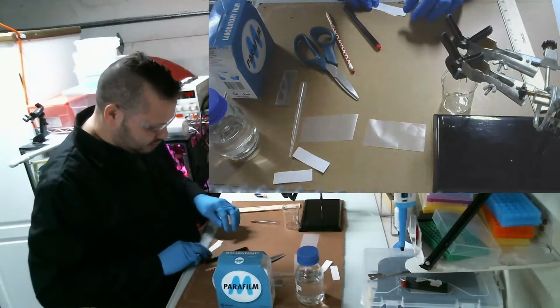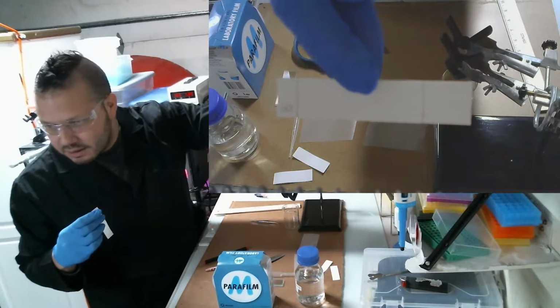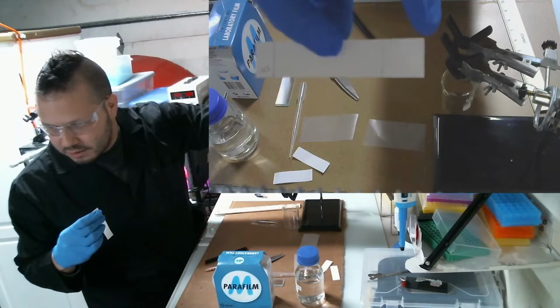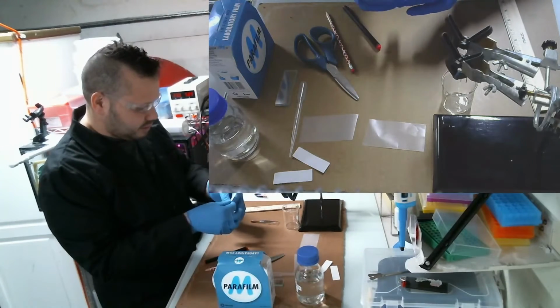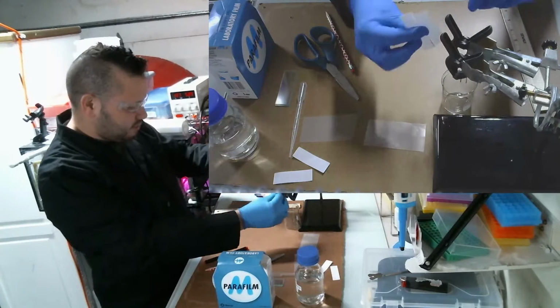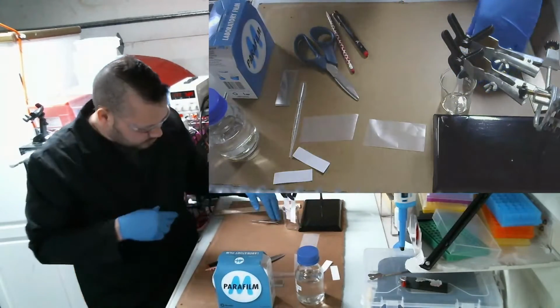Now I got to hang these two strips with the label side down. What I did is, let's see here, I don't know if you can see it, but I drew two lines and I labeled them A and B, one paper A and one paper B. That way I know, because I'm going to use two different concentrations of indole acetic acid, and then I have to put them label side down. There we go.